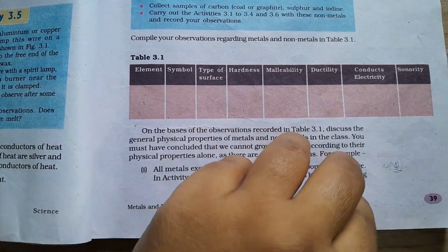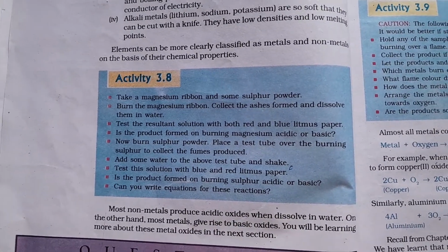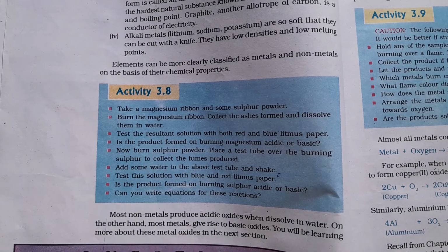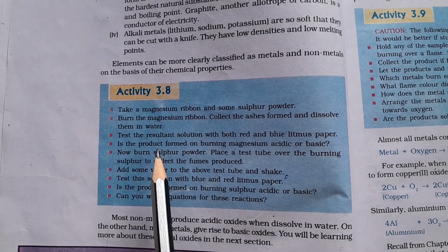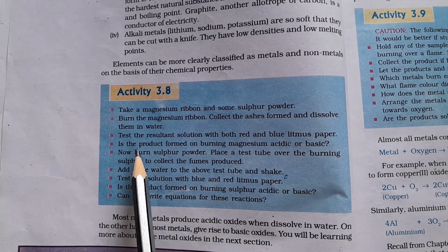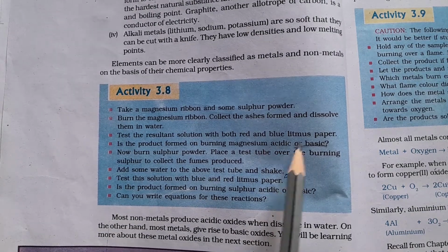Next, activity 3.8. What does it say? Take a magnesium ribbon and some sulfur powder. Burn the magnesium ribbon, collect the ash formed and dissolve it in water. Test the resulting solution with both red litmus and blue litmus paper. Is the product formed on burning magnesium acidic or basic? We'll check with the litmus paper, whether it is acidic or basic in nature.